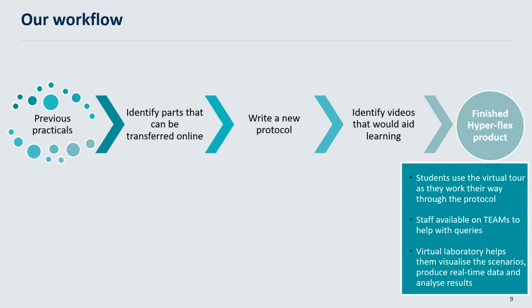And then obviously we came to our final HyperFlex product, which is a virtual tour of the analytical suite at King's College, and there are various hotspots to complement the learning. So you'd have a series of either the lecture, videos of the team actually analysing certain compounds, and then have tasks either through e-learning to interpret or look at changing the different parameters of the instrument to better understand how the instrument works.